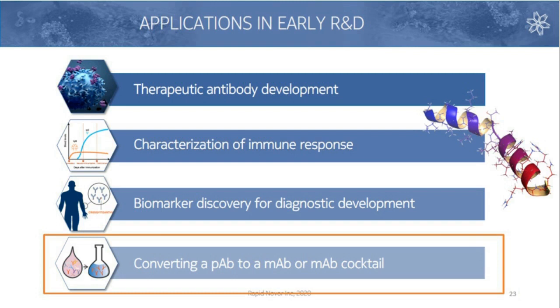Some are in COVID, some are not, but we are indeed able to and capable of and have successfully done this protocol where, in this case, the data I'm about to show you was against a peptide antigen. So we immunized rabbits with this peptide of interest, pulled out the polysera, put it through the workflow I just showed you, and here were the results.